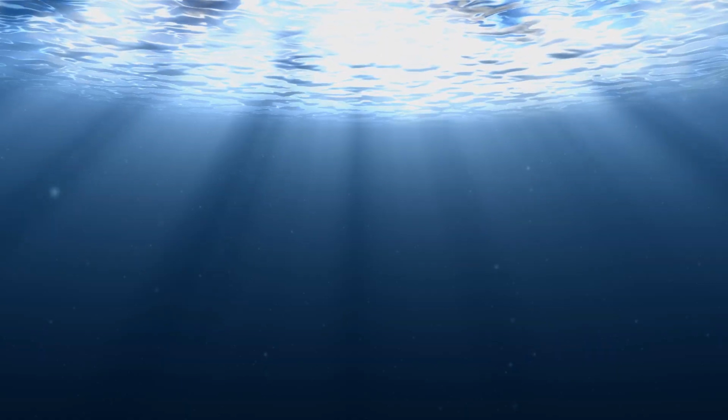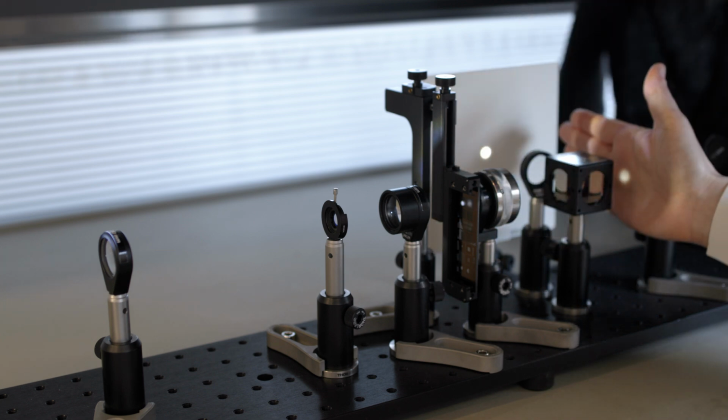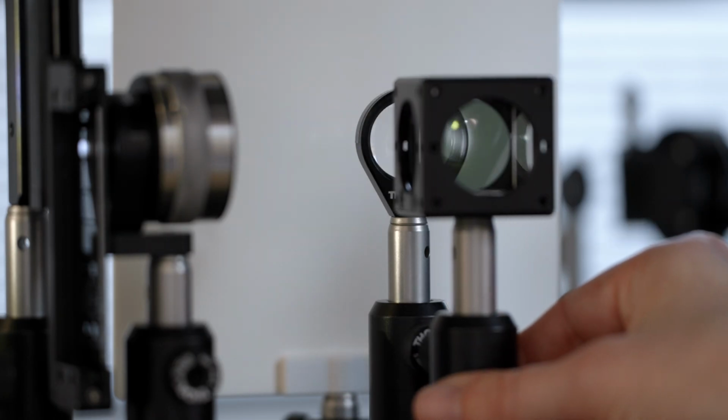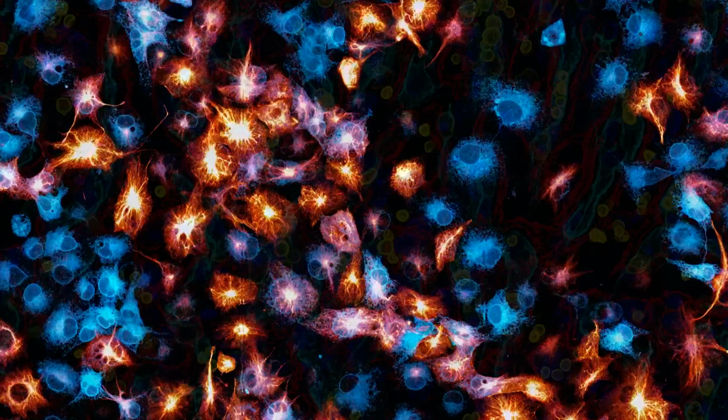Historically, in light microscopy, we're interested in how the path of light changes through a sample. This can be through reflection or absorption, or even through bending of the light, like you would see through a prism or a glass of water. And what we see at the end of this is a pattern of light and shadow. But if you're familiar with these beautiful images of our microscopic world, they're usually full of color. How do we accomplish this?